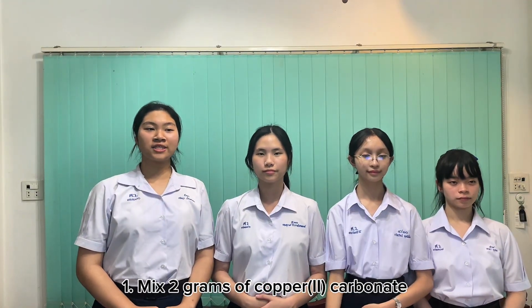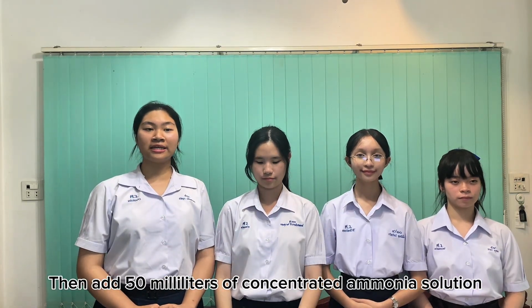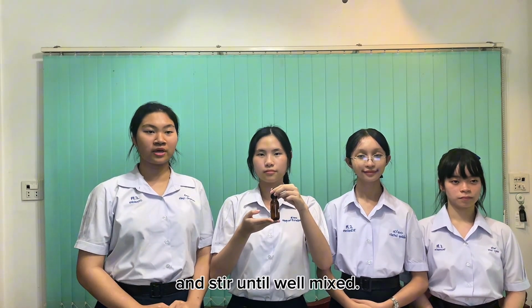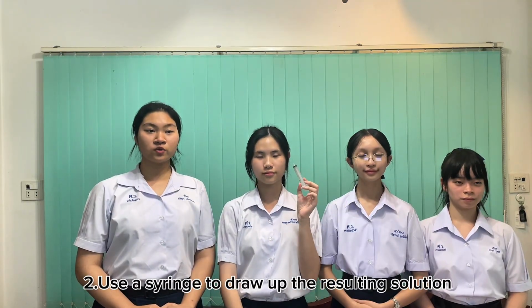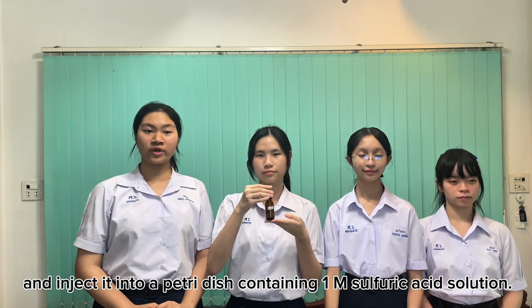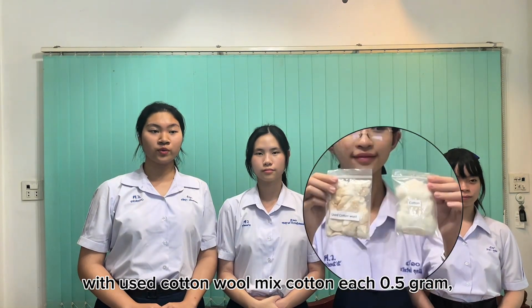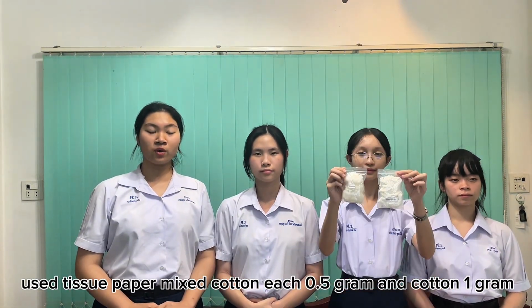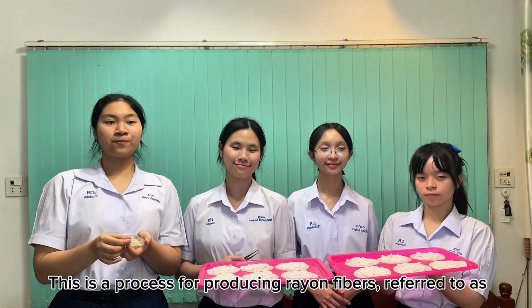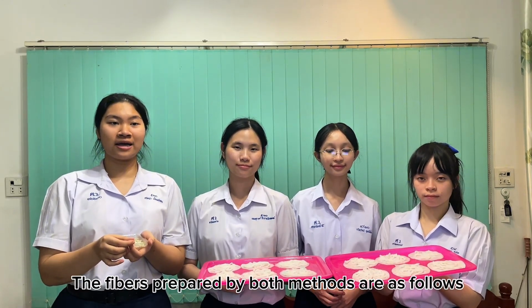Second method. First, mix 2 gram of copper(II) carbonate with 1 gram of cotton wool in a small cup. Then add 50 ml of concentrated ammonia solution and stir until well mixed. Second, use a syringe to draw up the resulting solution and inject it into a petri dish containing 1 molar sulfuric acid solution. And finally, repeat the method but replace the cotton wools with used cotton wools mixed with cotton, each 0.5 gram. Use tissue paper mixed with cotton, each 0.5 gram, and cotton 1 gram. This is a process for producing rayon fibers, referred to as the cuprammonium rayon process. The fibers prepared by both methods are as follows.